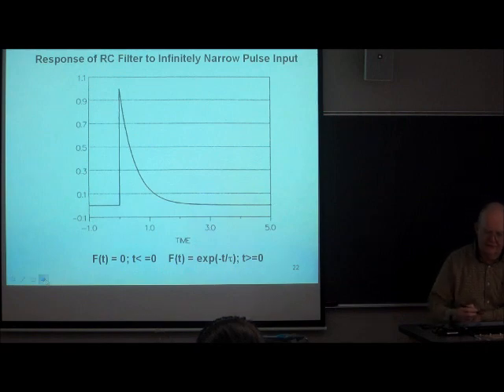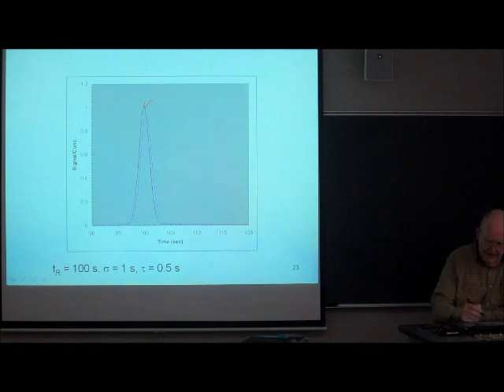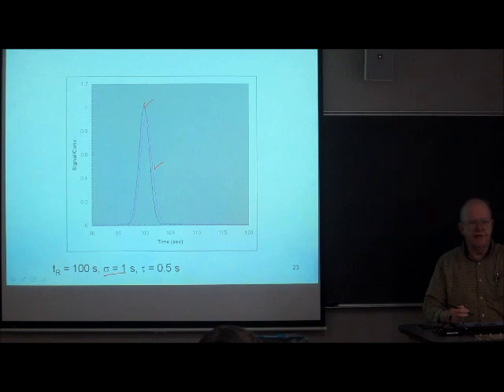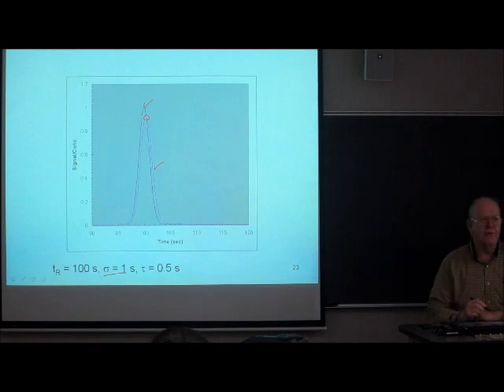I'm going to take a Gaussian signal and put it into this low-pass filter. So there's my low-pass filter response. I'm going to put a Gaussian into it now. And this is what I'm going to see. This is with a time constant of 0, and this is with a time constant of 1/2 of a second. The sigma of the underlying Gaussian is 1 second. So even if the time constant of the detector is a smaller number of units of time than the width of the peak in sigma units in time, there is some influence, and this peak maximum is diminished. It's less than that.